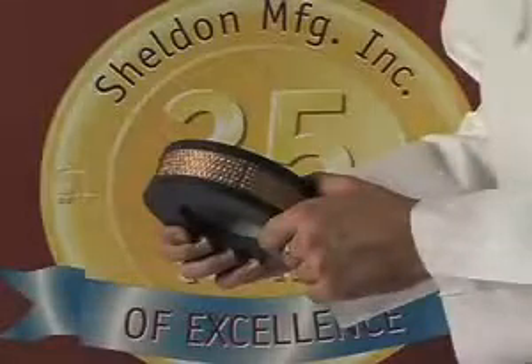Each incubator contains a patented HEPA filtration system with copper coating. This easily installed and replaced filter traps airborne particulates and deters bacterial reproduction.